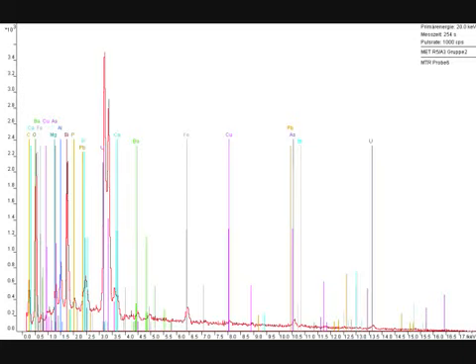But to my surprise, we also found arsenic there in the middle on the right, next to lead. And as you can see, we have a crazy mixture of all kinds of elements in there. Phosphorus and magnesium and barium and copper, just a crazy mixture of all kinds of elements. I really love this. Look at all those peaks. That's really almost impossible to analyze because there are so many peaks from all those different elements in there. But it's a very good example of chaos. I love chaos.